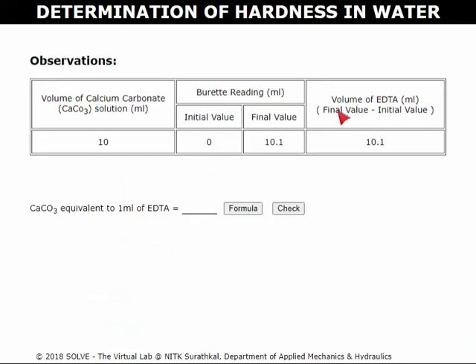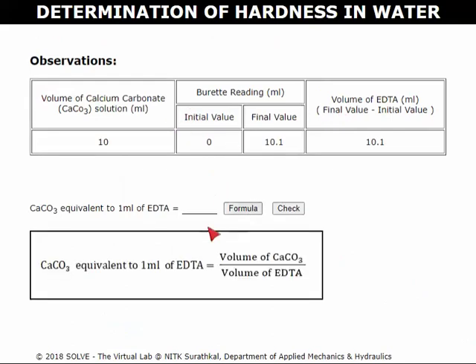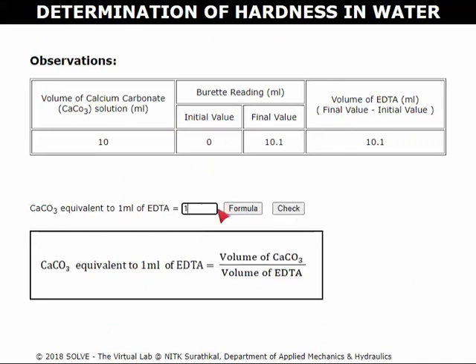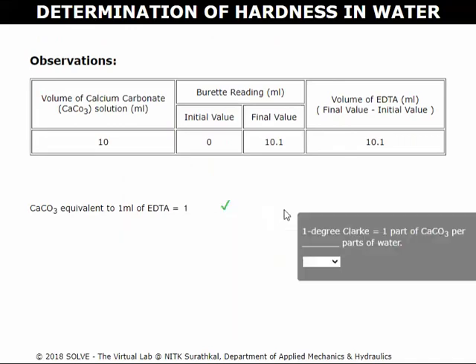These are the observations of the current experiment. To know the formula, click on the formula here. Enter the calculated value here. Click on check to check the result.